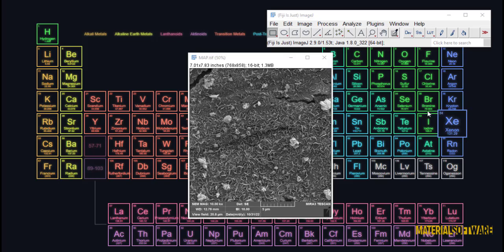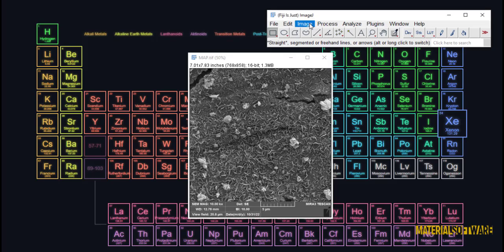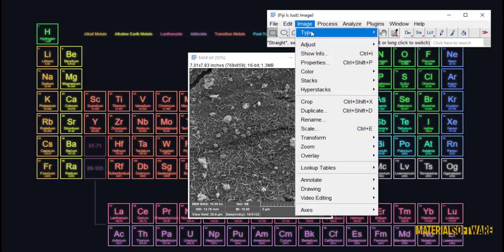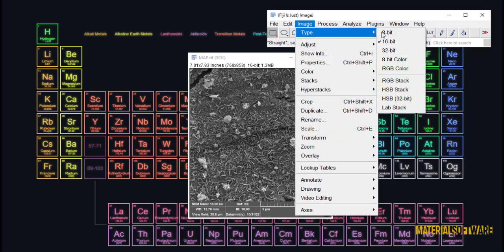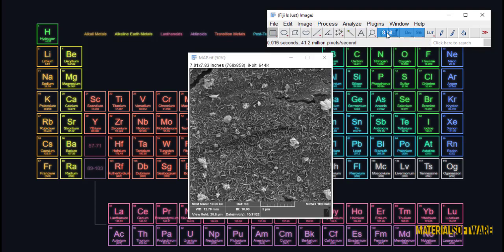Hello friends, I'm glad to be at your service again. I will give you another part of ImageJ software training. In this part we want to examine roughness and how this software qualitatively tells us what the surface roughness is like.